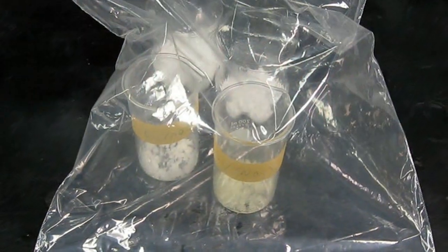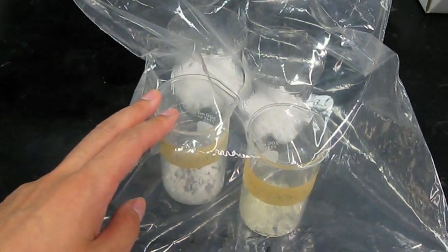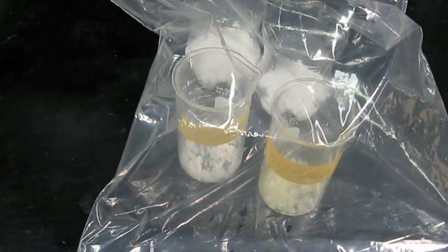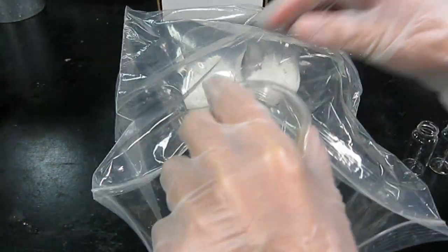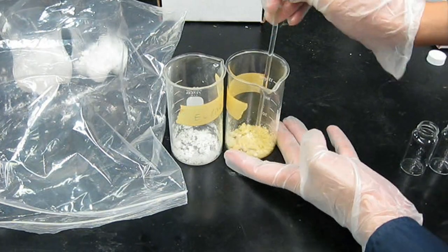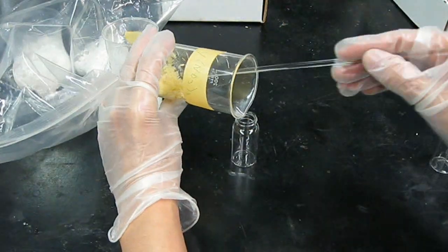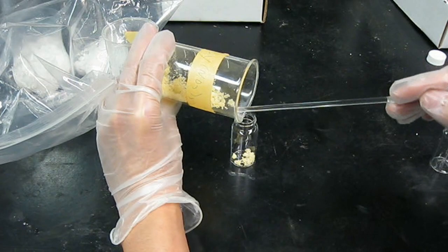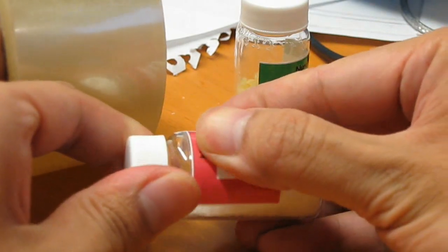Now place both nitrates into the desiccator bag we made in a previous video. You cannot simply boil them down because these nitrates are so sensitive that they'll decompose if heated to dryness. You also cannot simply leave them out to evaporate because they are extremely hygroscopic and almost never crystallize out of solution. After a few weeks in the bag with the occasional mash-up to expose any pockets of moisture, take out the nitrates. Make sure they are dry enough by crushing them and seeing if they crumble to a powder rather than a paste. If they are dry, transfer them into vials with airtight caps. Remember to clearly label the vials — after years of being a sloppy chemist I learned this important lesson the hard way.